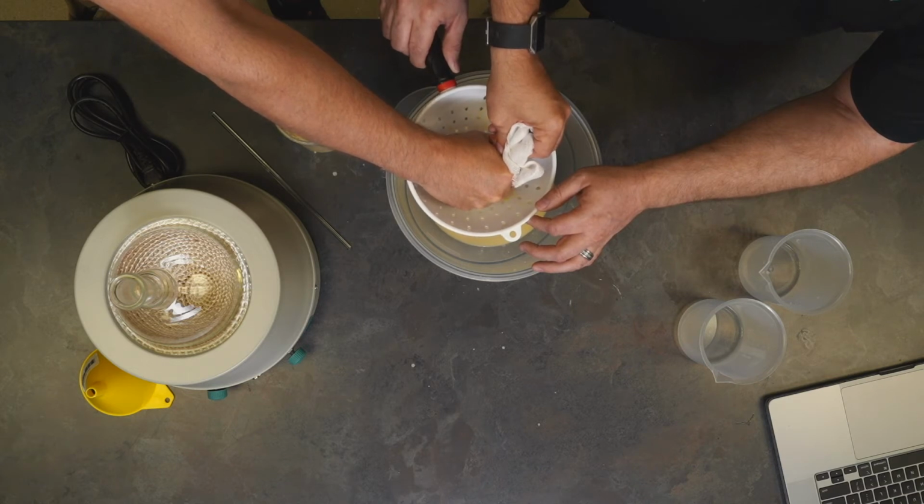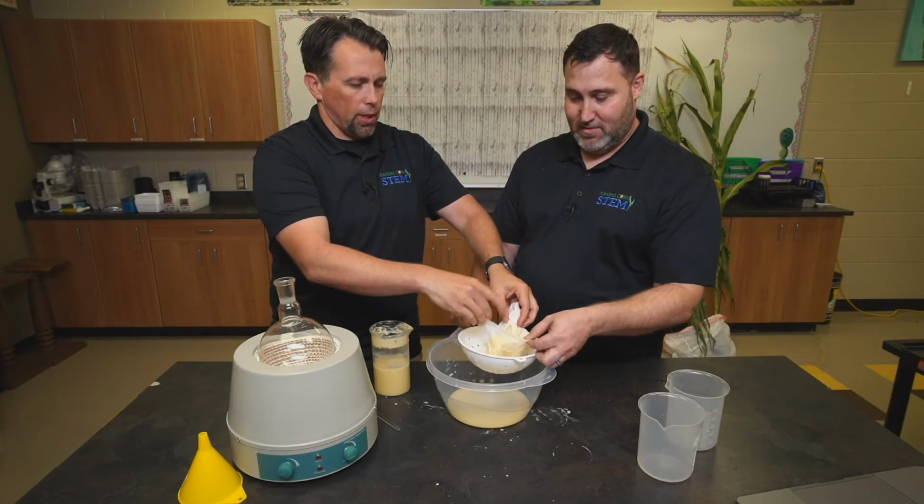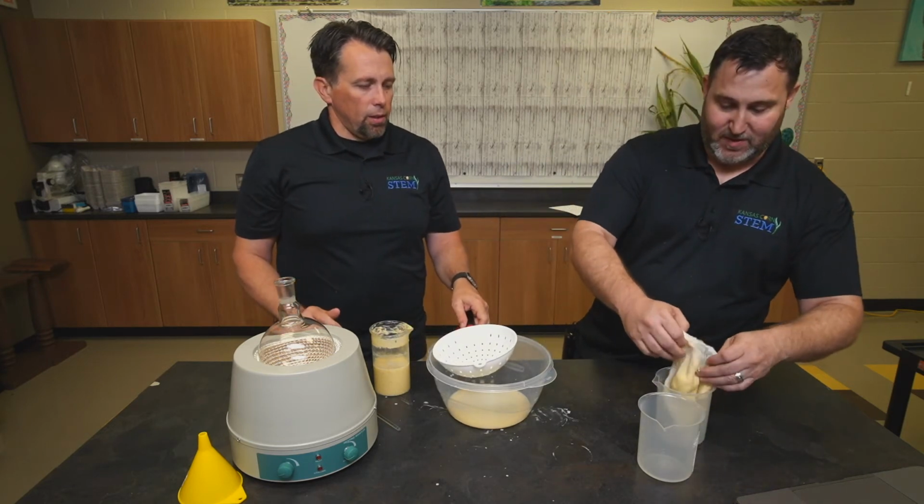Definitely smells some ethanol in there. All right, we'll open that up and add some more. Or do you want to put that in a container? Yeah, if you'll hold that, I'll go ahead and get rid of some of the solids and clean out our filter.